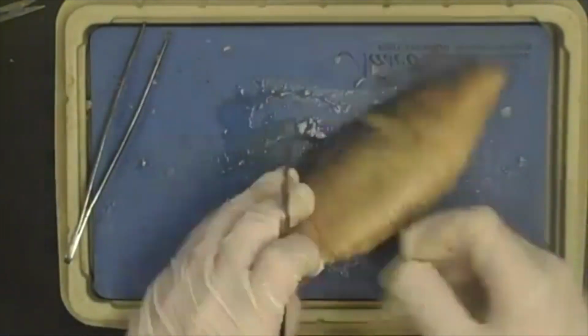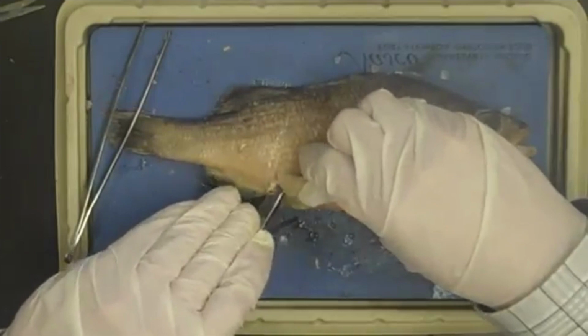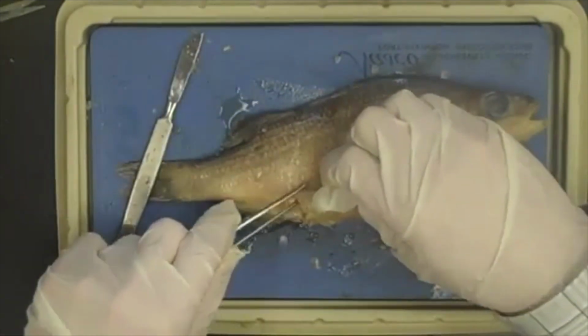With these 3 cuts, you should have a flap that's easily openable and should create a window into the internal structures of the fish.